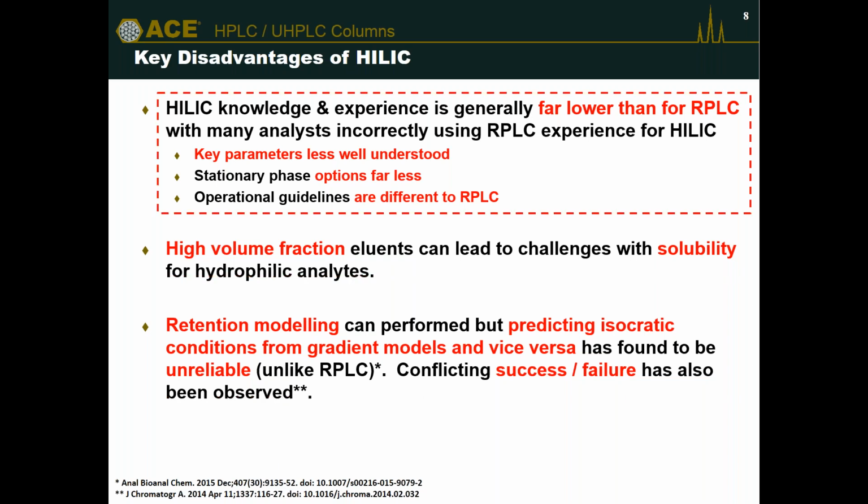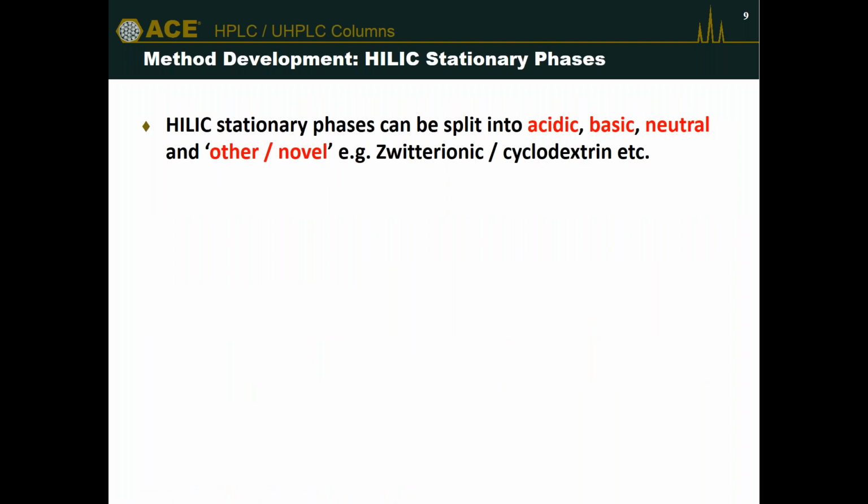Now, the purpose of this talk is to focus on the first disadvantage point I mentioned here. That's to try and share some practical knowledge and some practical experience based on the work that's been performed in our laboratory. Okay, so the first topic is around HILIC stationary phases.